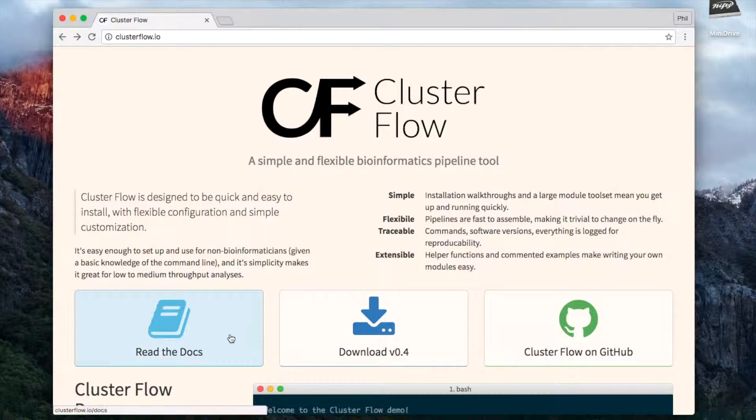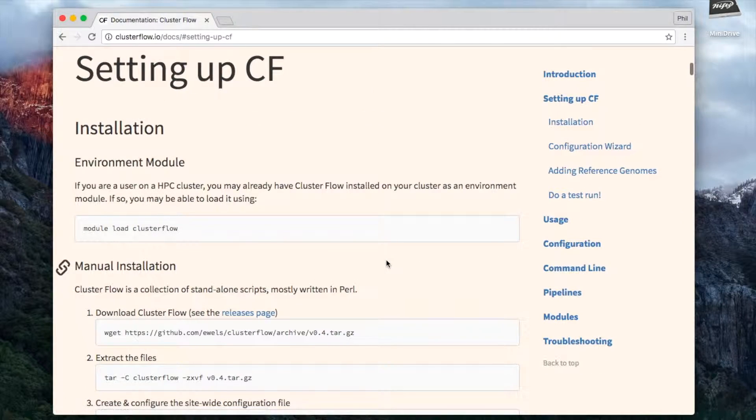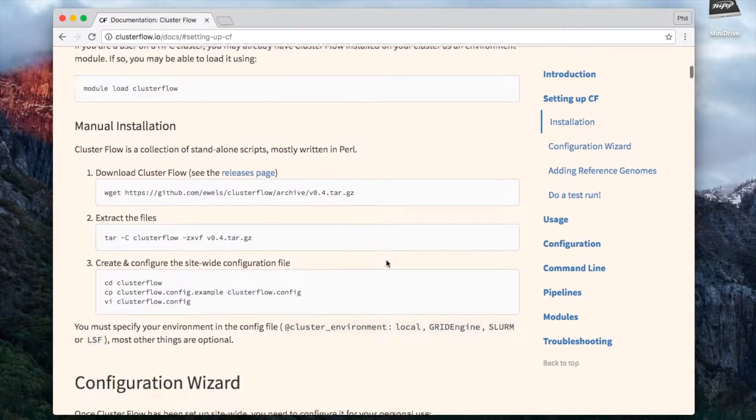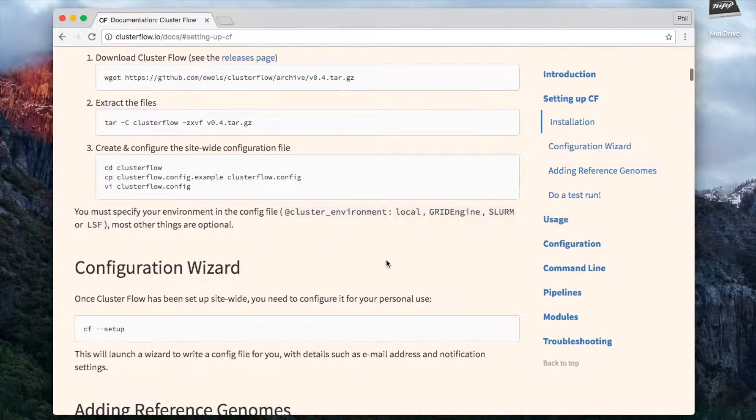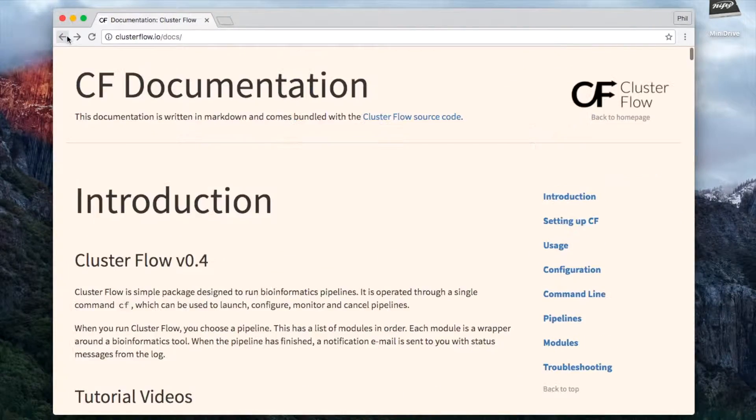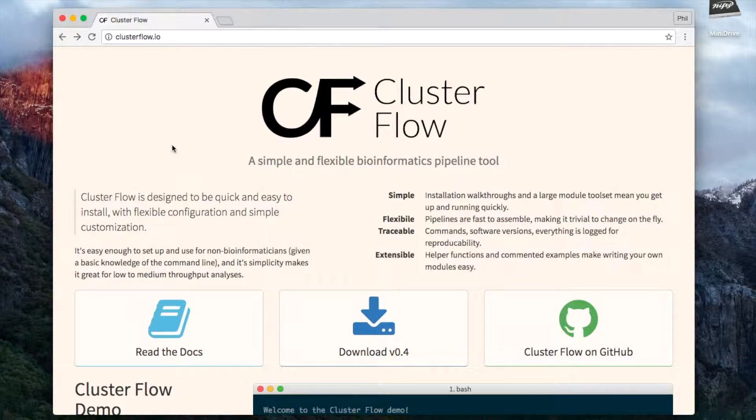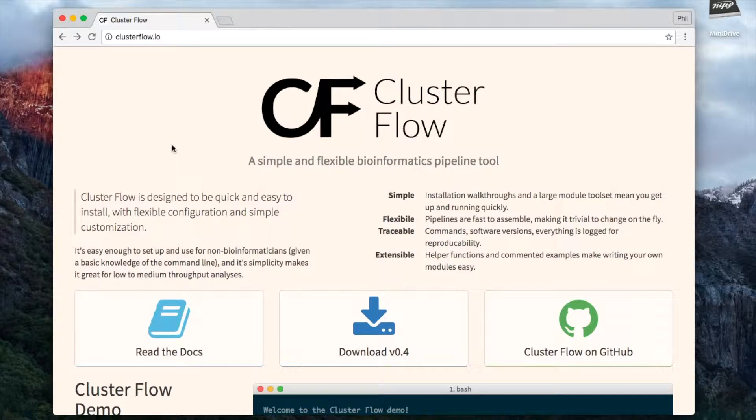Everything I'm going to discuss is covered in the documentation which is on the website under the section 'Setting up Clusterflow,' so if you want any more information you can find that there. Clusterflow is a Perl package, so to install it you just need to get hold of the files and set them up.